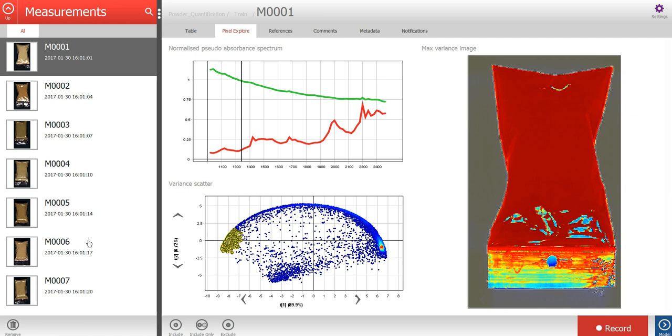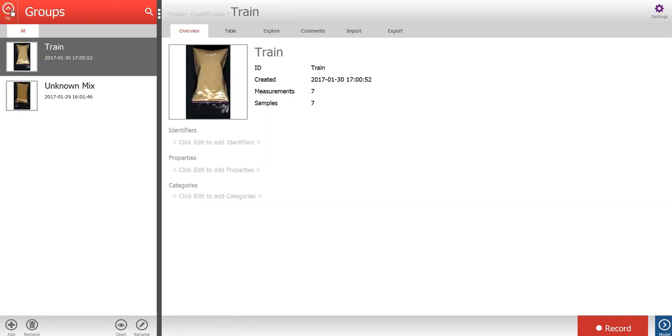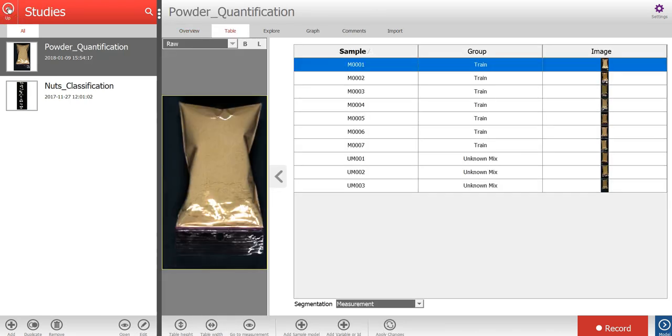Let's press the up button in the upper left corner to return to the group level, and then let's press up again to return to the study level.